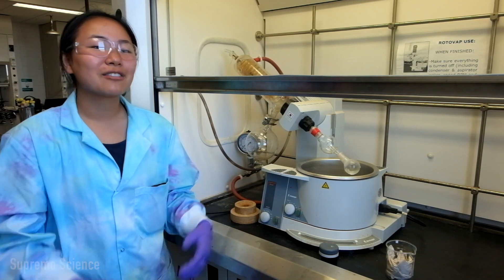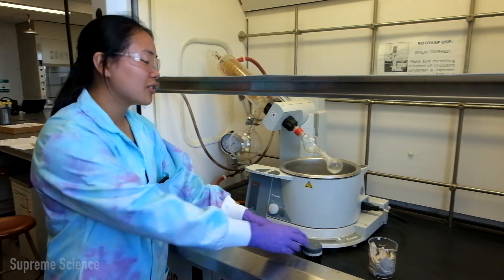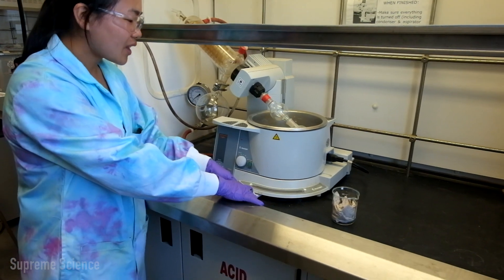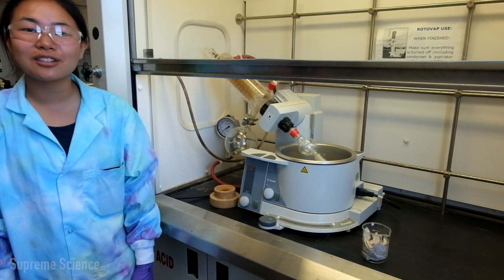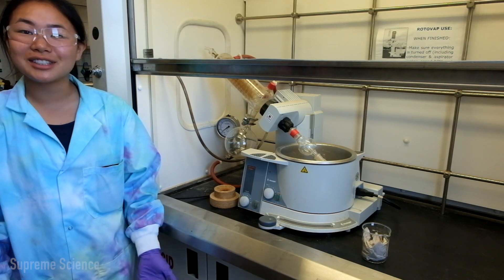So once you have your round bottom flask rotating, you can lower it into the hot water bath and increase the speed of the rotation. But today, because we're using a low boiling point solvent, we don't need to turn the heat on.